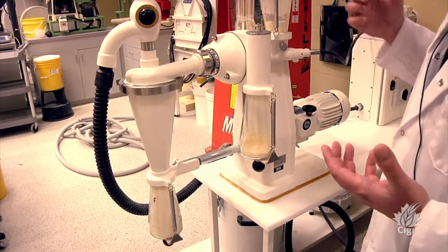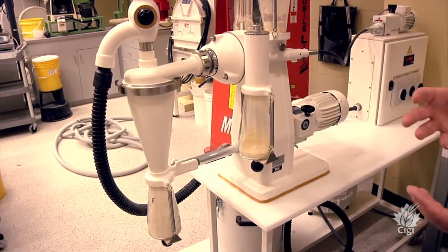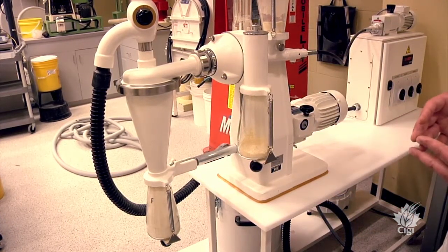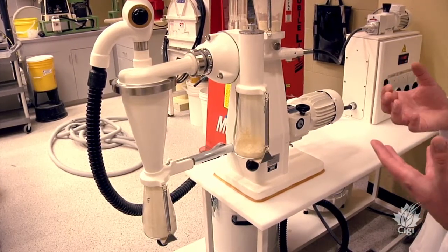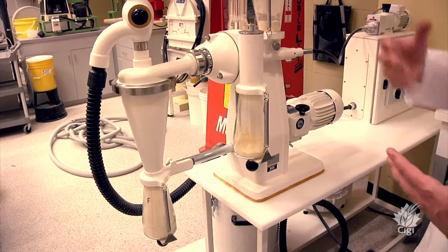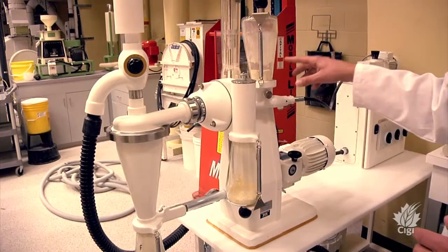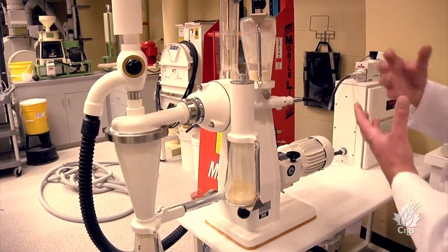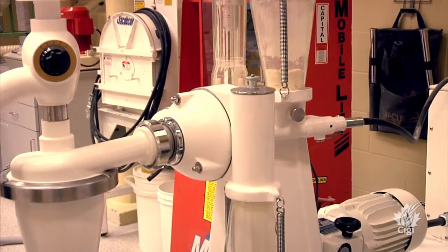What I will do is take the fine fraction and do a protein analysis on it, and that will tell me how much protein I have in it. What I would expect in this process is that I would start off with about 20 to 25 percent protein in the regular flour, and then the fraction would be around 60 percent protein.